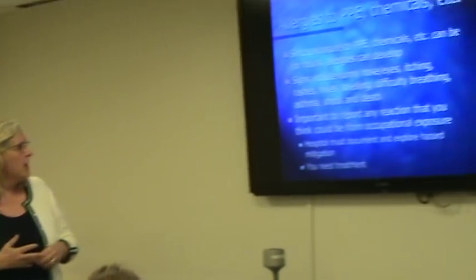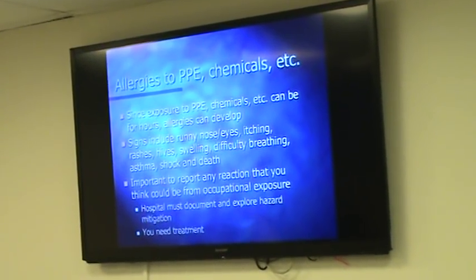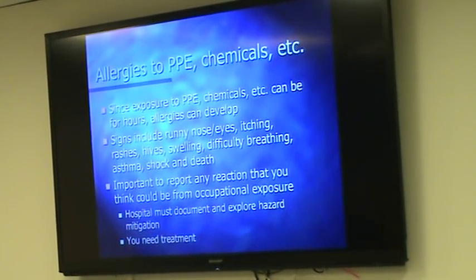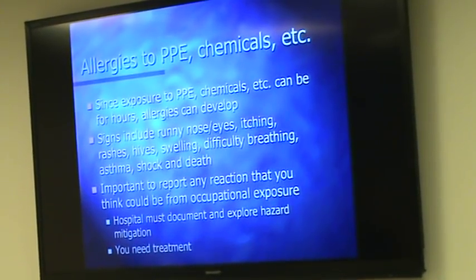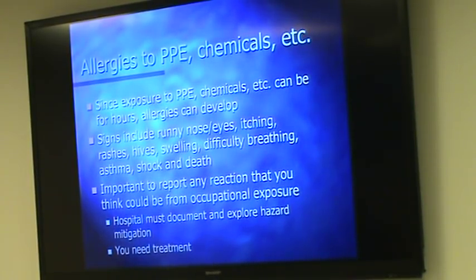Now, having said all that, you can get allergies to personal protective equipment, one of the reasons why the latex has really gone away, as well as allergies to chemicals and other things that you are encountering. So it is important for you to recognize what those signs and symptoms might be, because you should report them. It would be considered an occupational exposure potentially, and it would be something that the administration would want to know about. So if you have a particular brand of gloves or a brand of soap or hand lotion or whatever, and you've got people reacting to it, you probably don't want that in your place anymore.